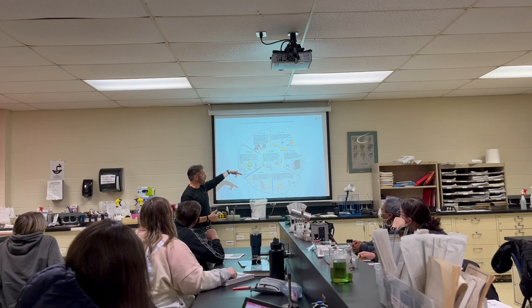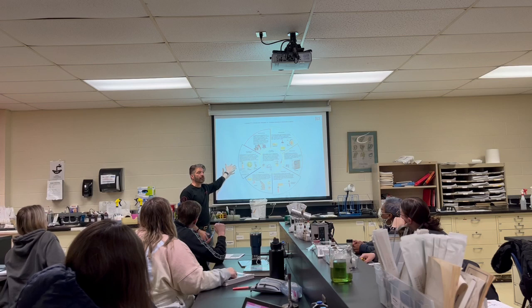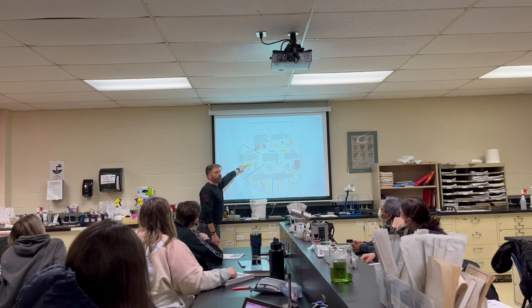Okay, so we're going to go through the steps of inoculating something, growing it. We're going to isolate it. We're going to inspect it. We're going to figure out what it is, and then at the end of the course, we're going to do some testing on different bacteria, and you're going to use some disinfectants or antimicrobials and figure out which one has the biggest zone of inhibition.